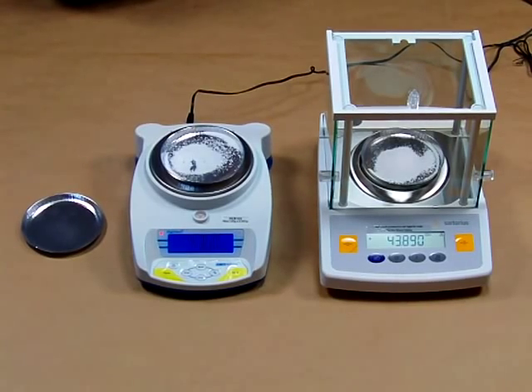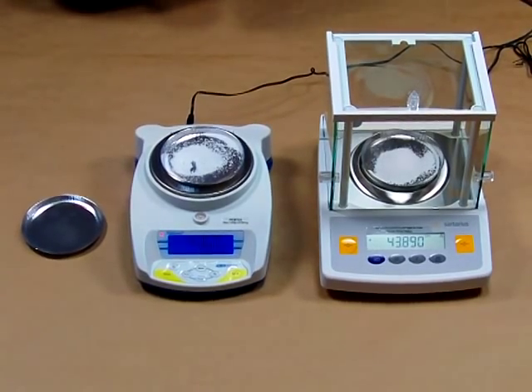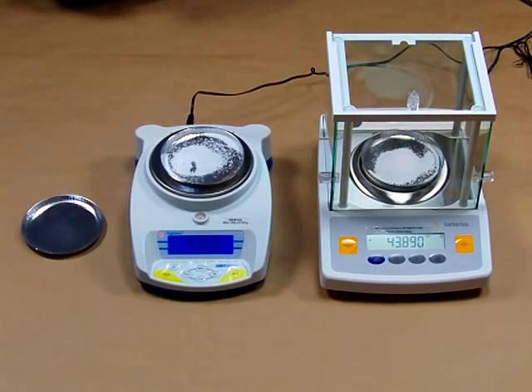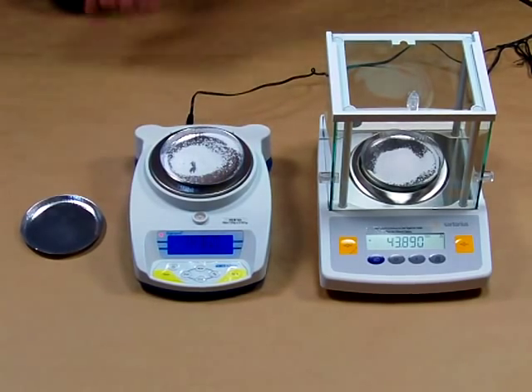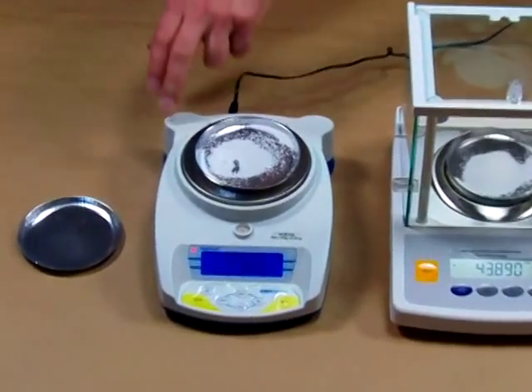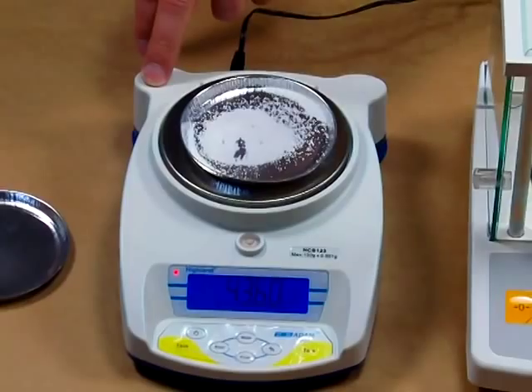Welcome to Precision Weighing Balances. Today we're going to give you a demonstration showing the difference between a strain gauge based scale and a force restoration balance. There's always a substantial difference in cost when you're looking for performance, but here we're showing an Atom Equipment HCB123 milligram scale.